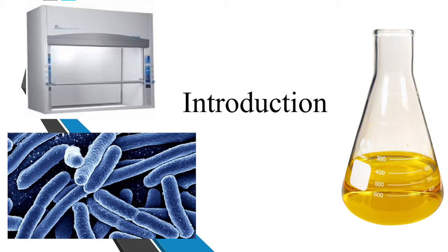The learning objective for this lab is to become familiar with bioreactors, how to run and simulate cell growth with media nutrient solutions, and determine how the Monod constant and maximum growth parameters vary based on media used. We also want to understand the batch kinetics of cells and how different parameters may affect cell growth. This will enable us to construct and interpret a bacterial growth curve using bacterial optical density data as well as glucose concentration curves. Bioreactors have many industrial uses, so being able to optimize cell growth with different parameters will make us more adequate engineers in the bioengineering world.